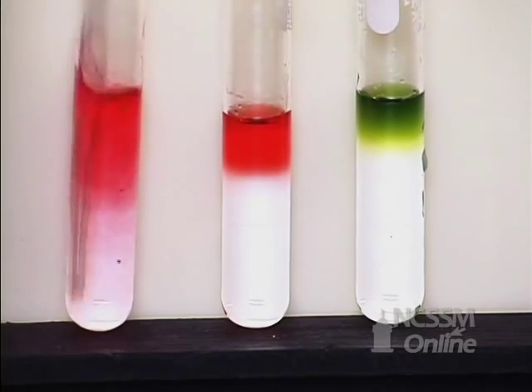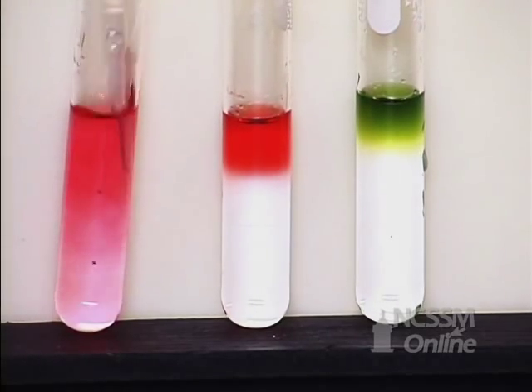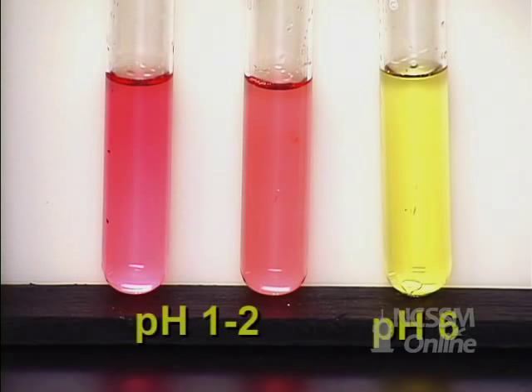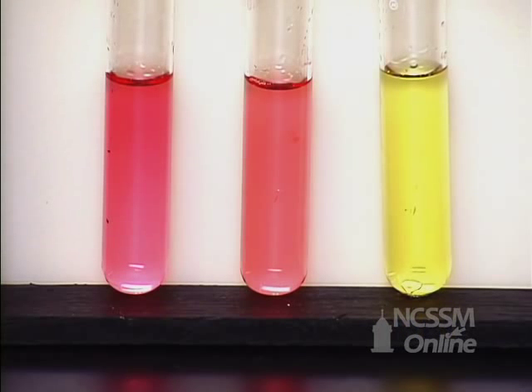So you see that the first two are red, indicating that they're acidic. These two are in the pH range of 1 to 2. This is in the pH range of about 6.